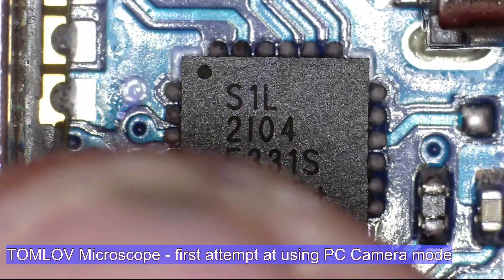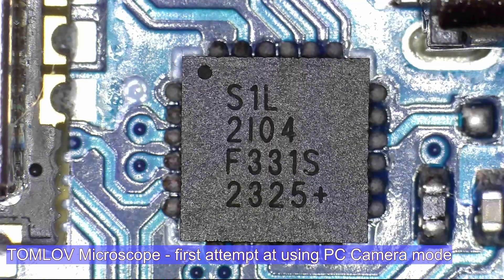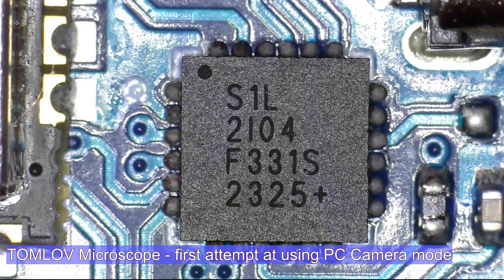There you go. I think that's quite good. Very easy to use, and I have no experience with this at all. So I'll get better and better as time goes on. I could quite easily sit and solder this board now if I wanted to. But this is just to show you what you can get out of the thing.